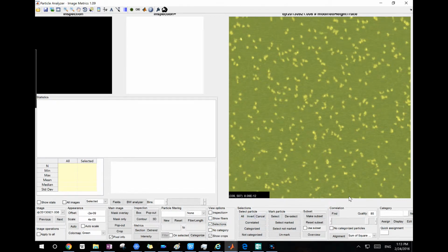So the usual way to do this, here is why we want to do correlation of particles, because as you see, we have particles that are randomly aligned on the surface. If we want to find some similarities between them, we have to realign them, and if the structure patterns are really repeatable, reproducible, we might even want to average them.